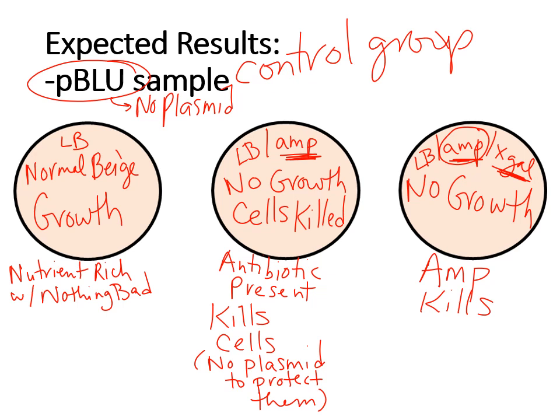But ultimately, you have to think about what were you expecting and what could have gone wrong. This is important because I will ask you to do some troubleshooting in the results analysis. Okay, so make sure you pay close attention to the various things that can go wrong. Also think of every step in the procedure and where something can go wrong, okay?